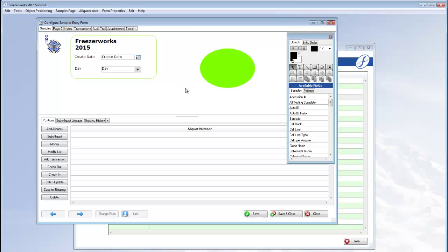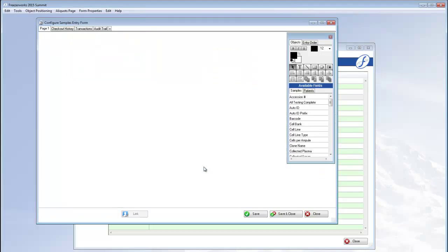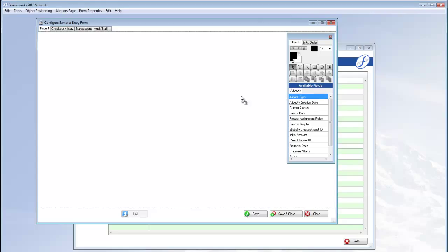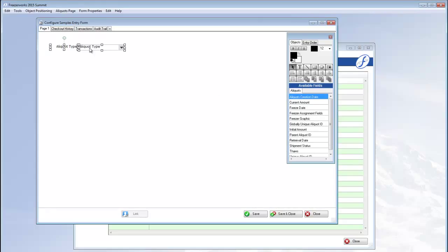To edit what fields appear in the aliquots area, right click the list view and select edit this aliquots form. The palette changes to include aliquots fields now. Drag and drop the fields you want onto the aliquots form, just like with the samples section.